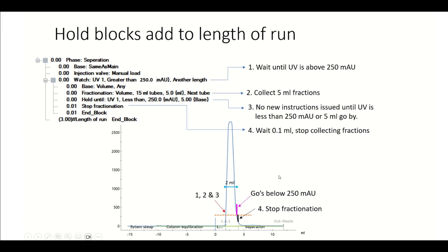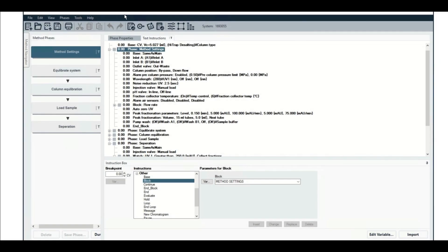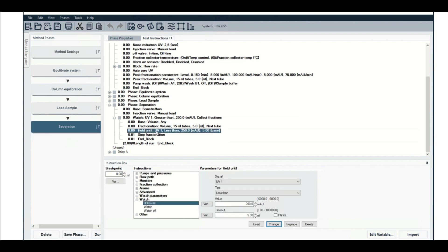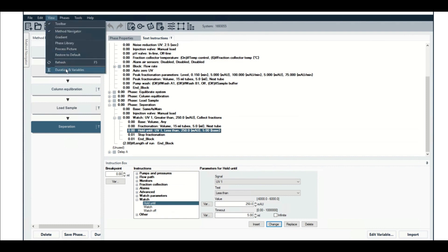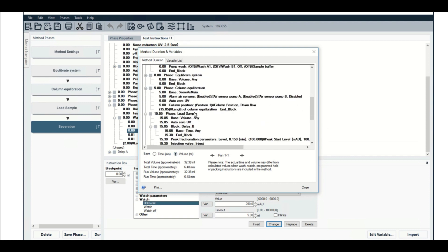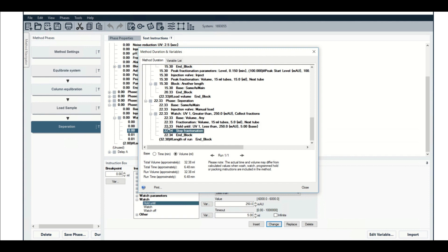So we'll go back to unicorn real quick for a split second. Okay, so here we are in unicorn. This is the method, the desalting high trap method. We can see here, here's the hold until UV less than and stop fractionation. So let's look at this hold until view duration and variables all the way down here. Oh, we want to be in volume, so go down one more time. Okay, so according to this, both of these things are basically going to happen almost at the same time, 22.33 and 22.34. Well, given the situation that I just showed you in the slide, that's not how it's going to work out. This is actually going to happen at 24.34 mils, not at 22.34 mils because during this hold, we're not going to issue new instructions and we're also not going to let the timer tick by for the method.